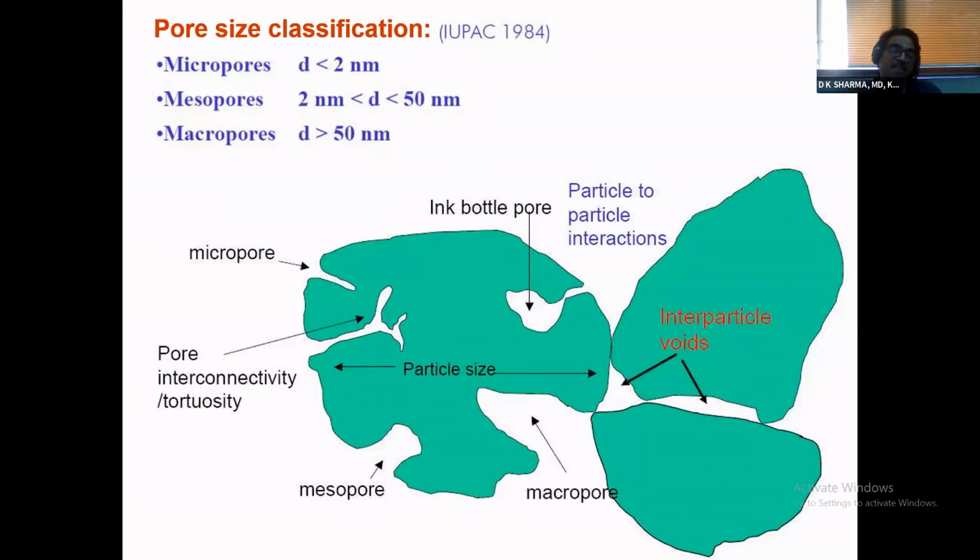Micropores are the result of your lattice structure, the way your molecules combine together to form the material. Okay. So while micropores exist in the lattice, it is the intrinsic crystals inside the crystals, in the crystal lattice. Micropores arise from there.